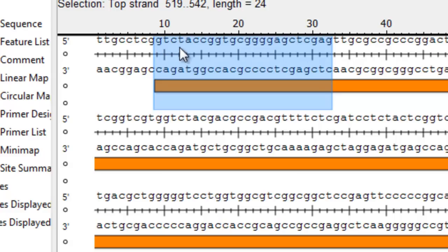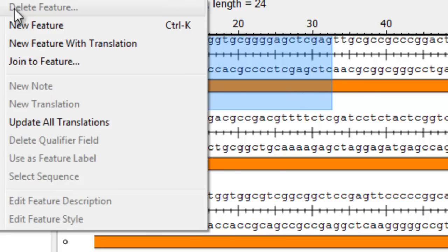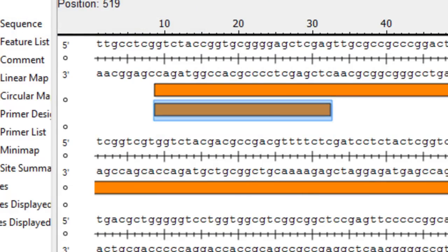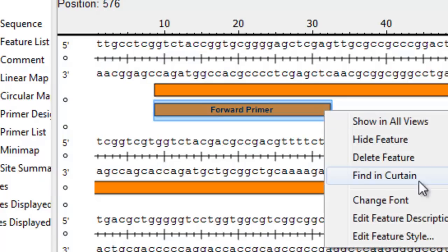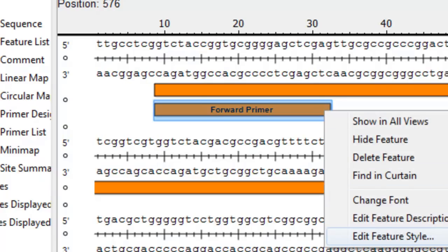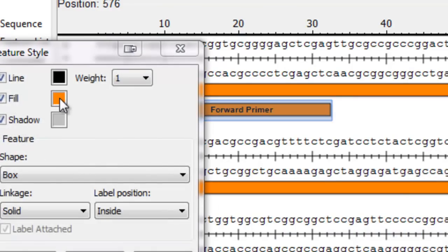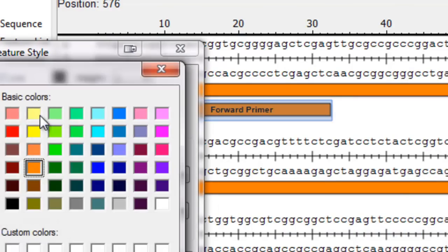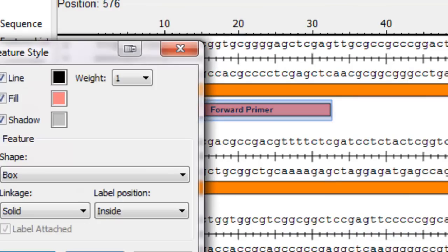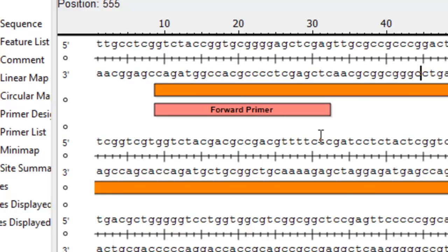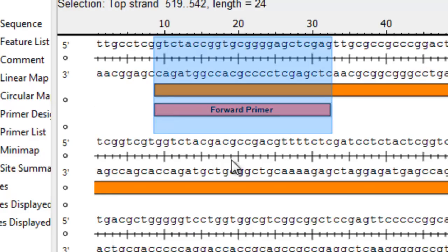So I have these 24 bases highlighted at the beginning and I'm going to indicate that by using a new feature function and I'll type in forward primer. And I can change the color so it's easier to see I guess. So here we have the forward primer design and it's the first 24 base pairs at the beginning of the sequence that you're interested in.